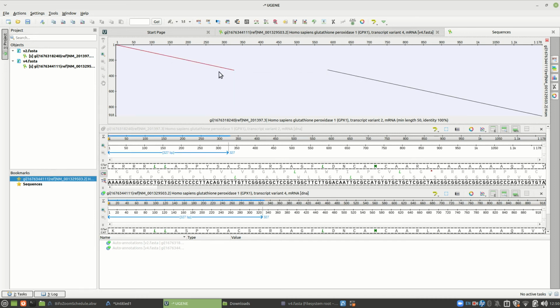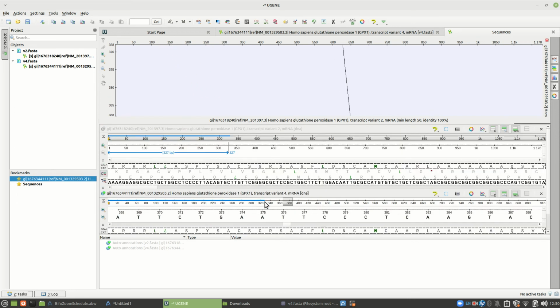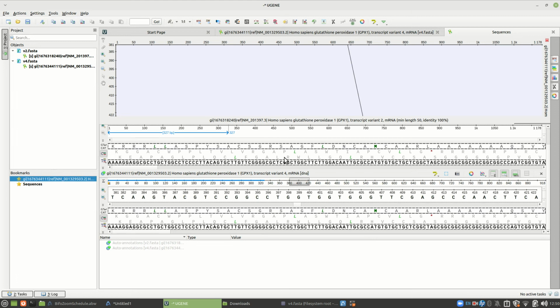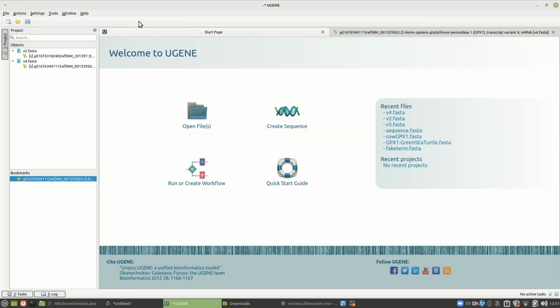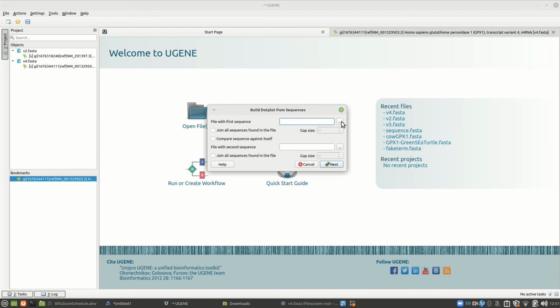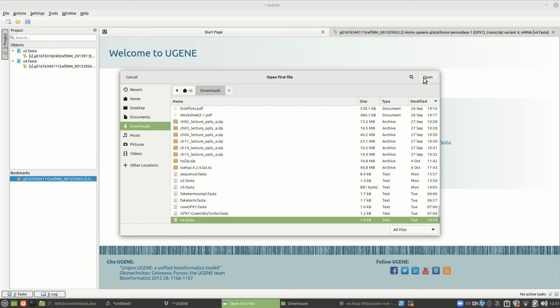So you can make the analysis that, hey, this stops. This makes a tiny little protein. And it actually doesn't use this piece down here because there's a stop codon there. Let's go see what that stop codon is, though. So let's go back and redo our analysis. I'm just looking at it against itself with version 4, just to check ourselves.